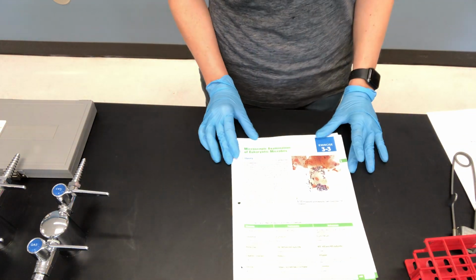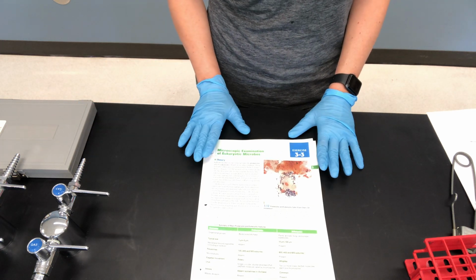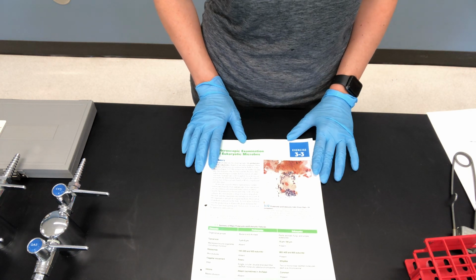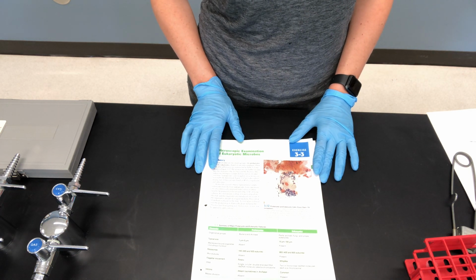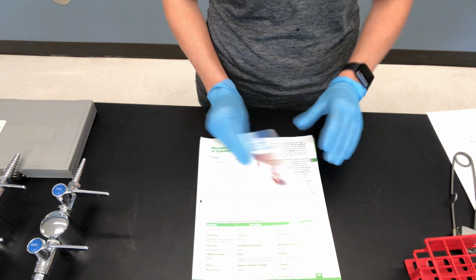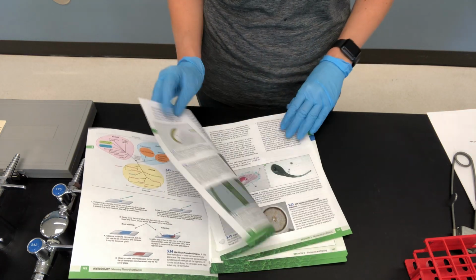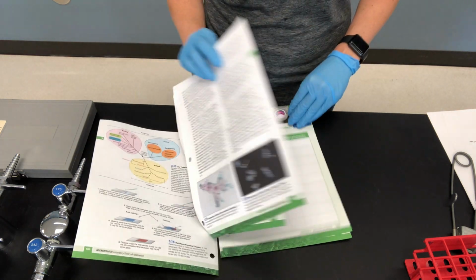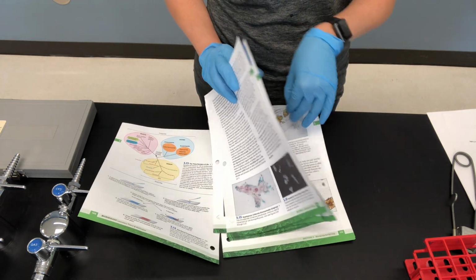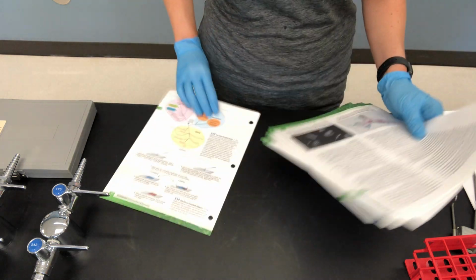Okay. Then we're going to take a look at some prepared slides. And lab 3.3 is eukaryotic microbes. We do have an option in today's lab to look at pond water and living bacteria. So this just has a whole bunch of different potential specimens that you could see in the pond water. Right, so all of these different diagrams. You may or may not see all of these things in our pond water, so just more for reference. Okay.